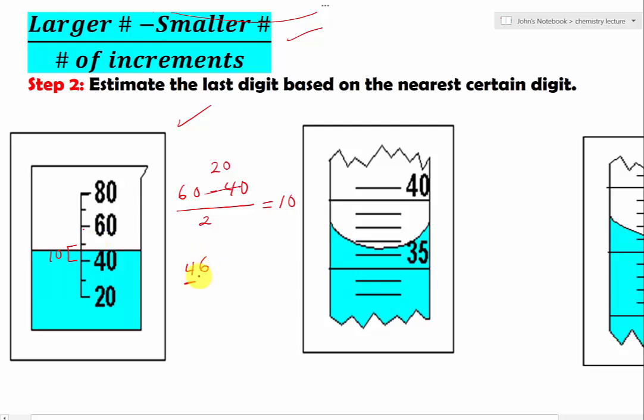Do we need a decimal in this case? No, because we are estimating at the 1 places. So we don't have to go as far as the decimal places. So our answer could be 45, 47, but it cannot be 45.0, or 47.0, or 46.0, because we did not go as far as the decimal places.